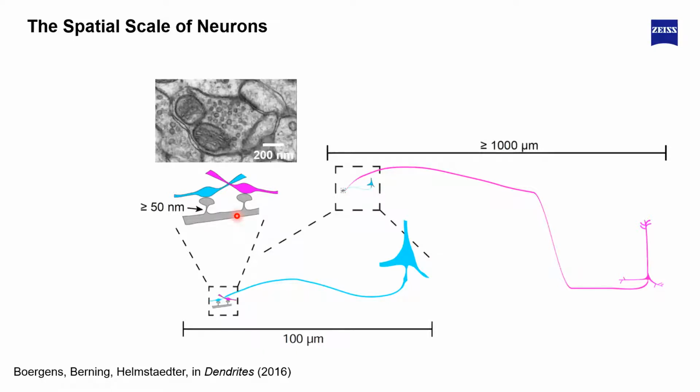So here, this is a cross-section of one of those synapses where we see an axon bouton, right, these thickenings with neurotransmitter vesicles, and this is most likely, I cannot see the whole structure, one of those spine dendrites that you see here in gray. And here, the synaptic cleft and the density tells me that this is the communication site of the chemical synapse.